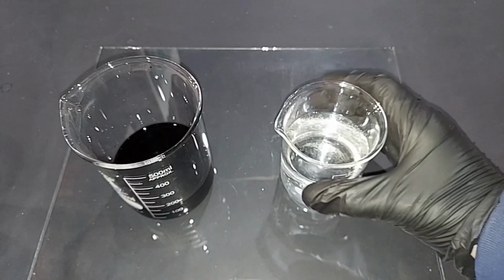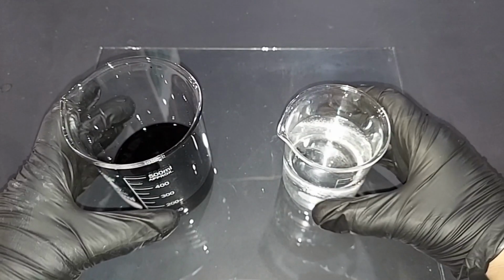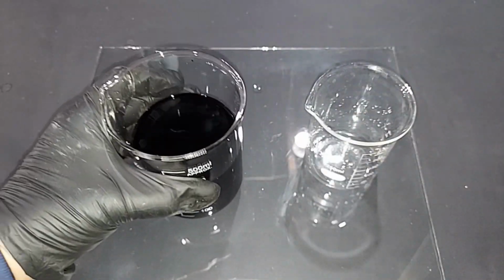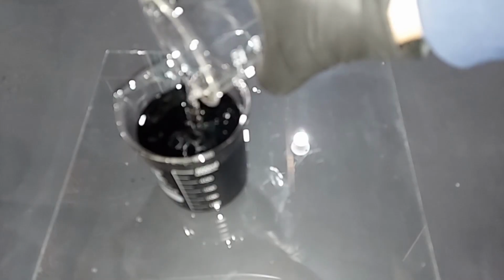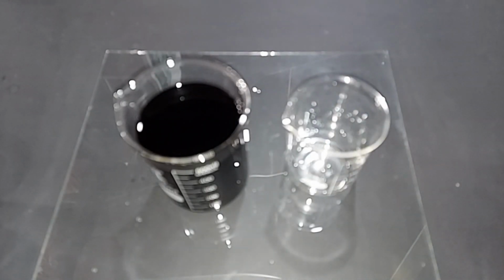There's about 200 milliliters of distilled water in here, and there's 160 in here, of course. So I'm going to add at least, I don't know, 120, 130. We'll see where we're at. And we'll let it sit for just a second. I'm going to go ahead and add another 100 or 120. There's a little bit of guesswork here, but the idea is to drop it as fast as you can.